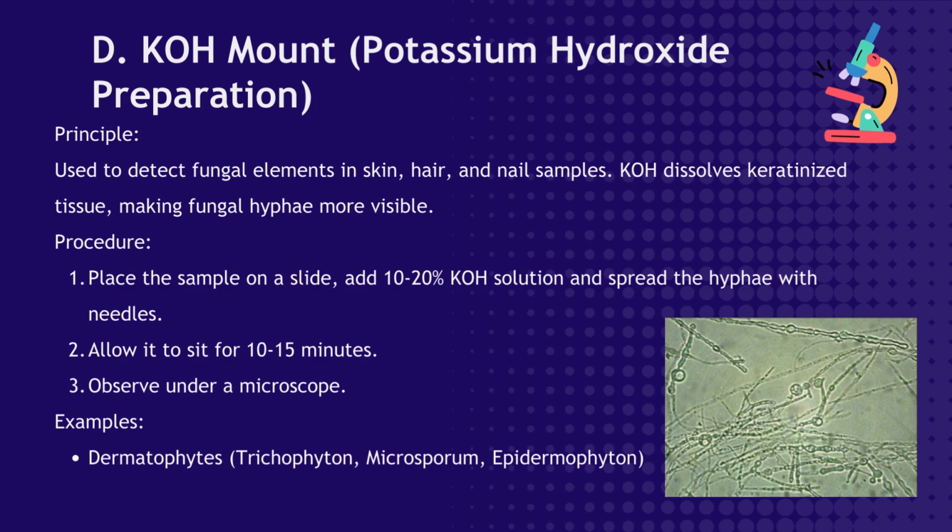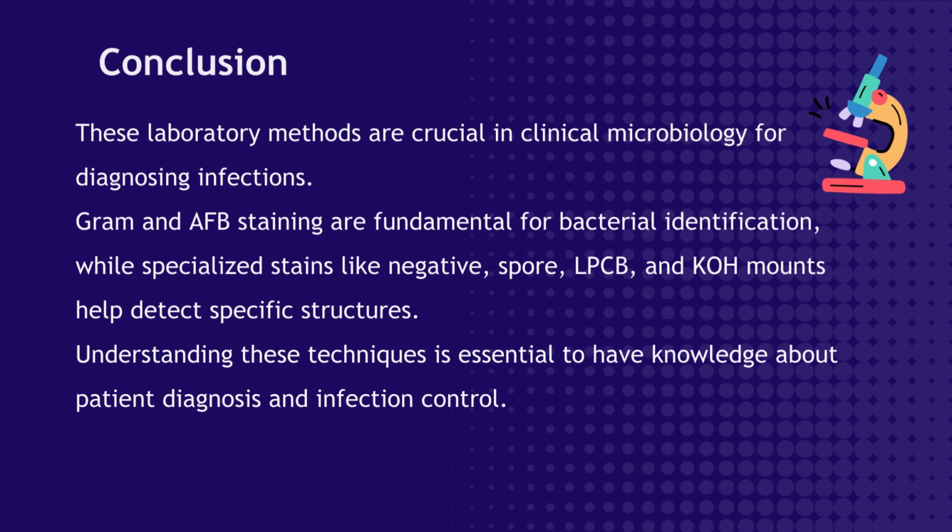Allow it to sit for 10 to 15 minutes. Observe under a microscope. Examples: dermatophytes, Trichophyton, Microsporum, Epidermophyton. Conclusion: these laboratory methods are crucial in clinical microbiology for diagnosing infections.